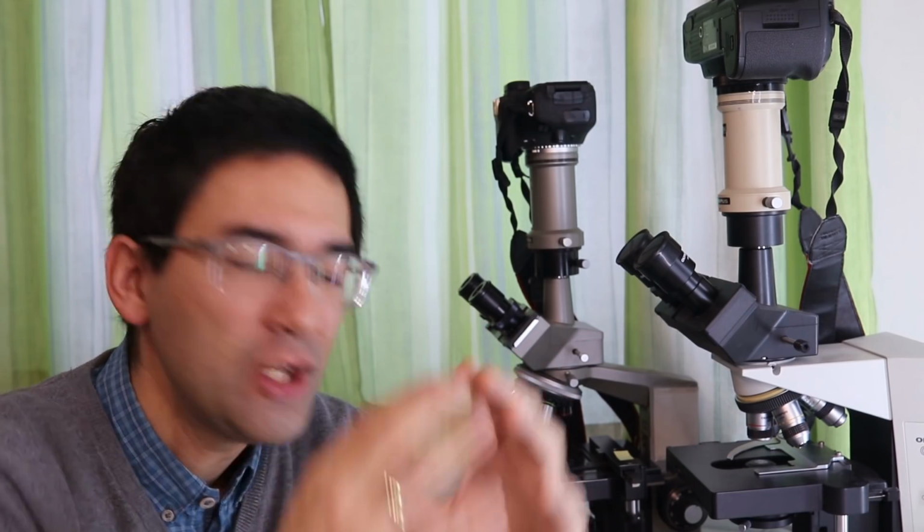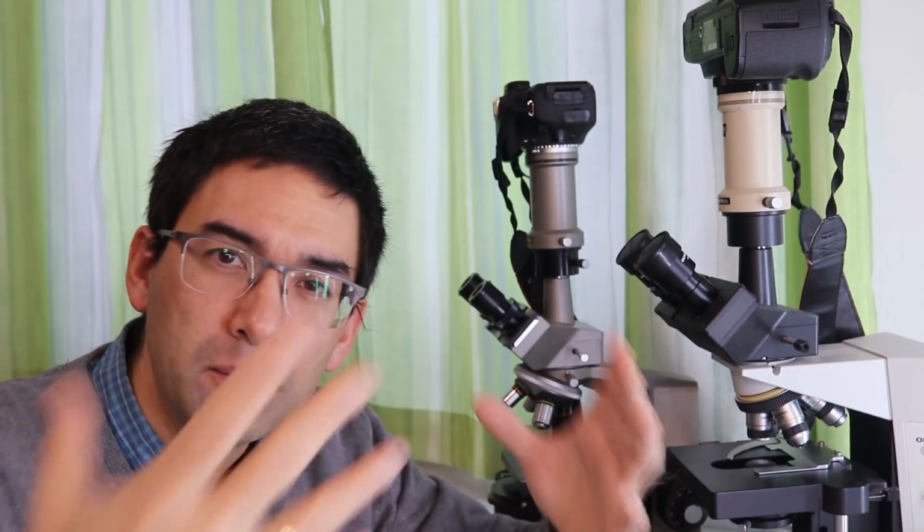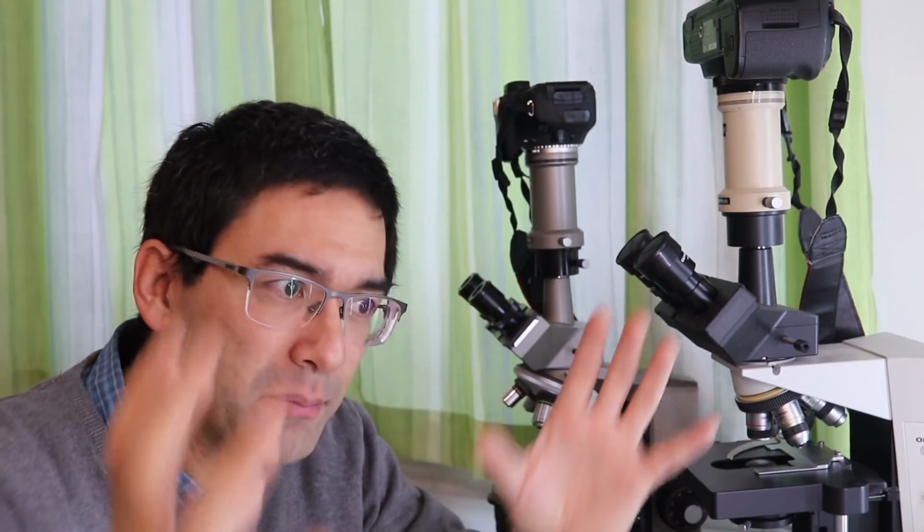It gives you a better orientation because it's not like looking through a small keyhole, but you get a fuller view, and therefore it's also subjectively more pleasing. I would also say it's probably better for long-term microscope use, because you don't need to concentrate as much, and you simply see more, and that's simply nicer.